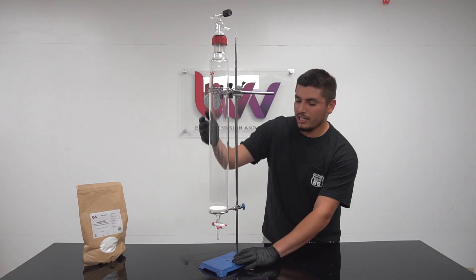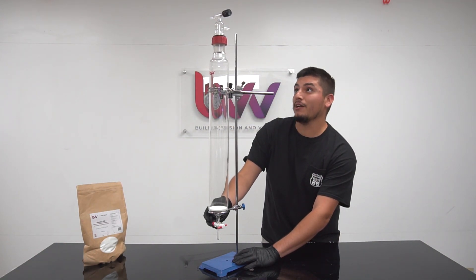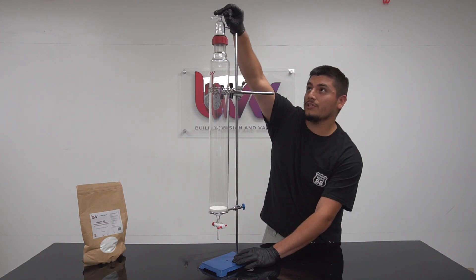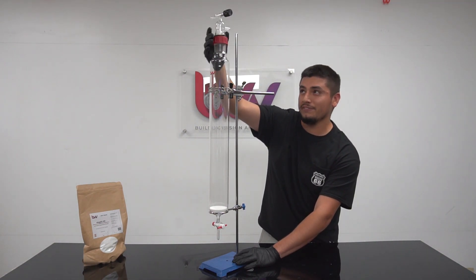It features a 3 by 24 column with center disc and stopcock at the bottom. On the top you have a valve with needle control as well as a rodaviss joint.